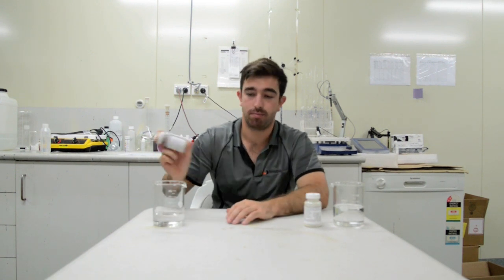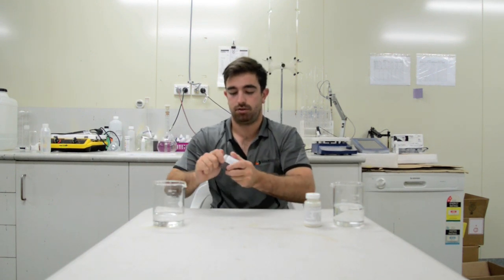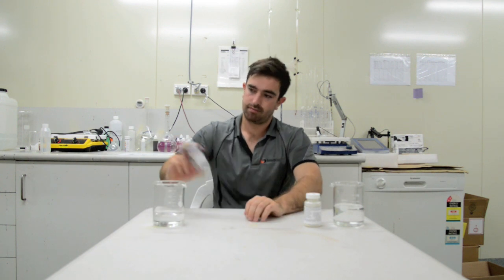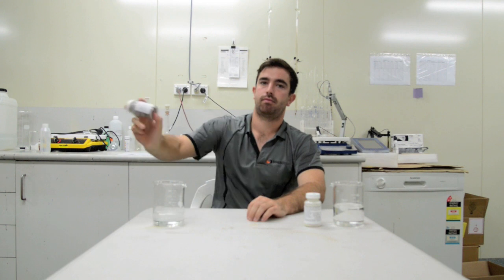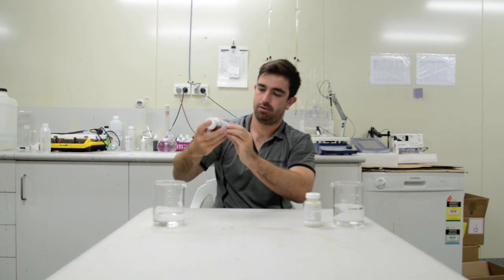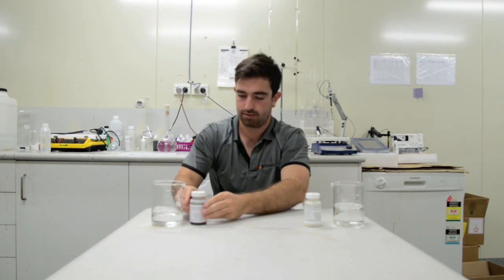You're going to shake until all the medium is dissolved. Once all the medium is dissolved, we'll do the other one.